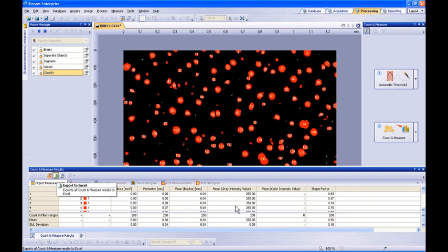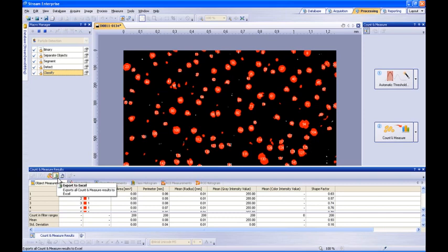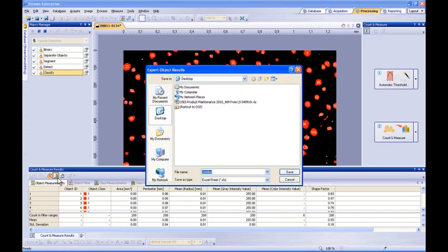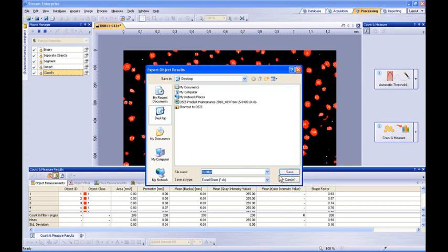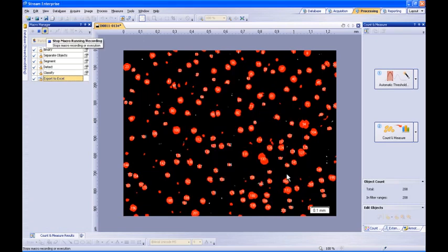Measurement results can then be exported to Microsoft Excel with the click of a button. Simply define a file path and give your spreadsheet a file name, then click the save button. The workflow is now complete, therefore we can stop recording the macro by pressing the stop macro recording button.